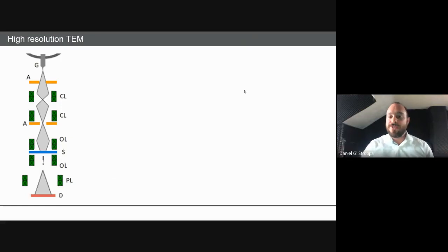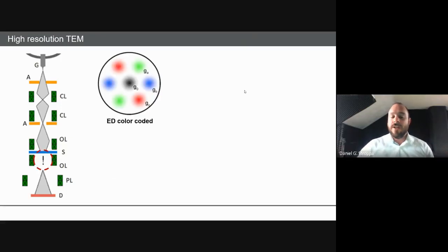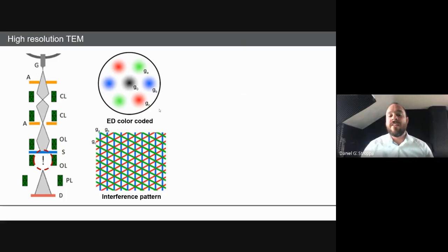And then when you further propagate those components, they are going to reconstruct the image in terms of frequencies. So another way of thinking about this is that the TEM, or the objective lens, is essentially a machine that is going to do a Fourier transform. So you have the sample, that's your real space. What you see in the diffraction pattern is going to be related to the spatial frequencies that will be allowed because of constructive diffraction effects. And if you continue propagating, those components are going to recombine, and they're going to generate an interference pattern.